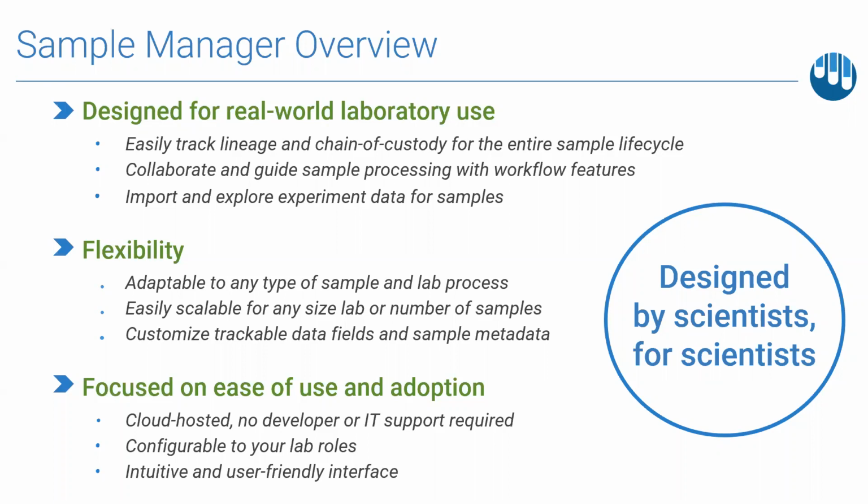In those consultations, we heard that adoption of new laboratory tools can often be a barrier. And so we're offering LabKey Sample Manager in the cloud only. And this really does eliminate the need for internal IT and technical input, making it very easy then to adopt and embrace within your place of work.